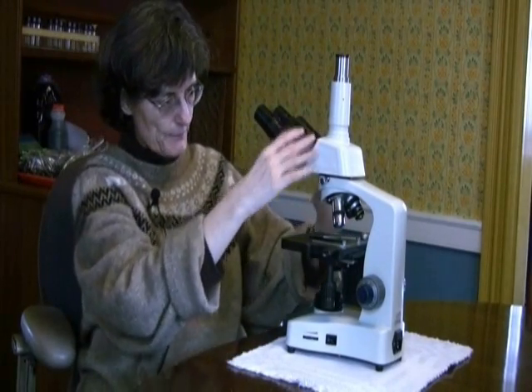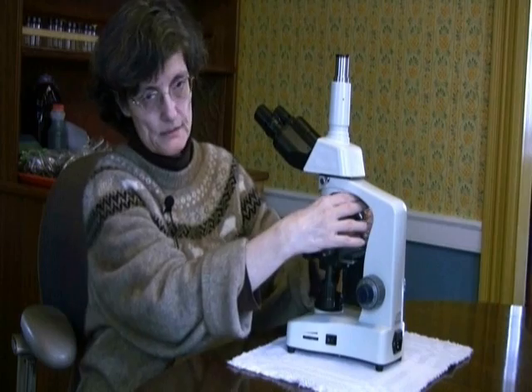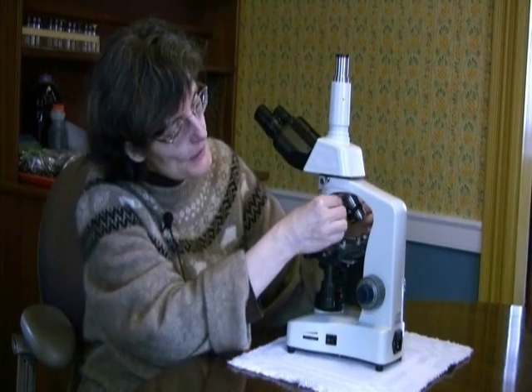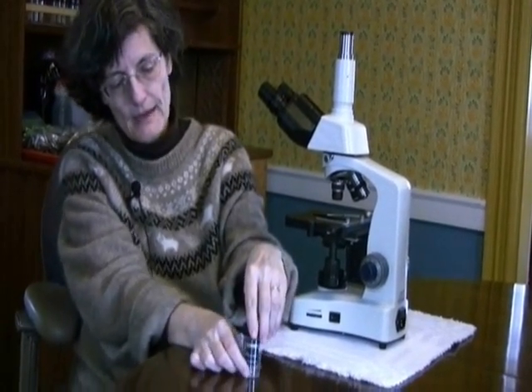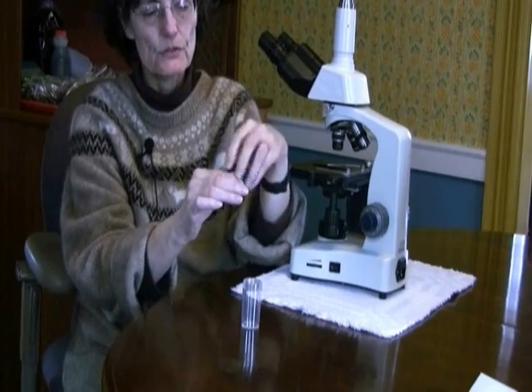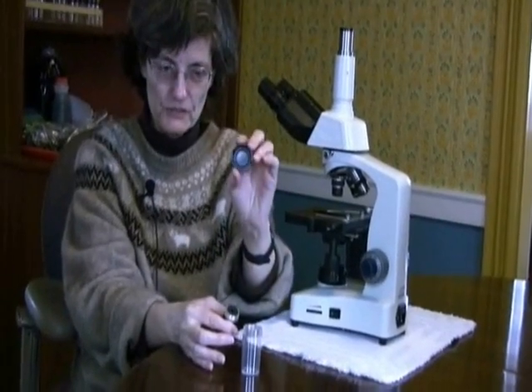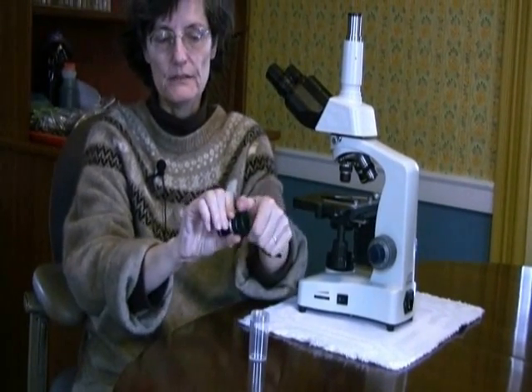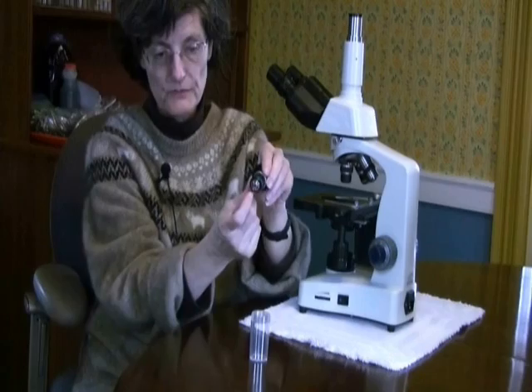Okay, so we've got that set up. Now we want to keep going down our microscope, and the 4x, the 10x, the 20x objectives are already on here, but we want to put the 40x objective in. So we've got to find that, and typically they come in these kinds of plastic containers. Notice that 40x objective actually screws into the lid. And so you typically can tell a plastic container that's meant for an objective because the lid has something that you screw that objective into and protect that lens. Here's the expensive part of that lens.